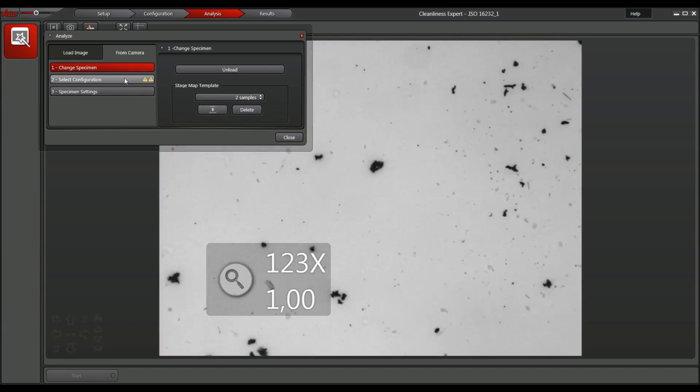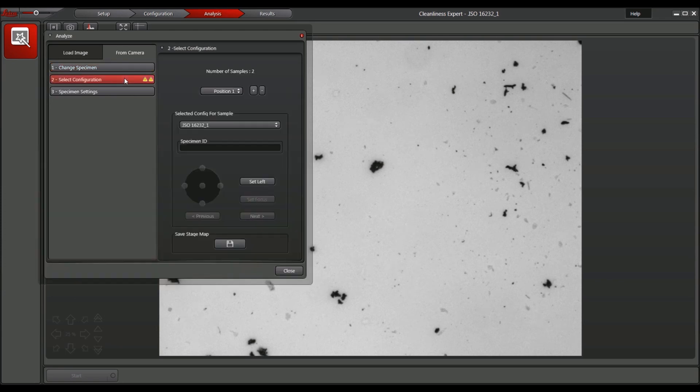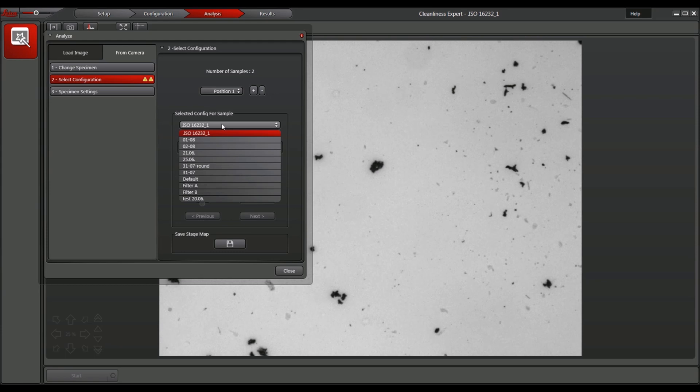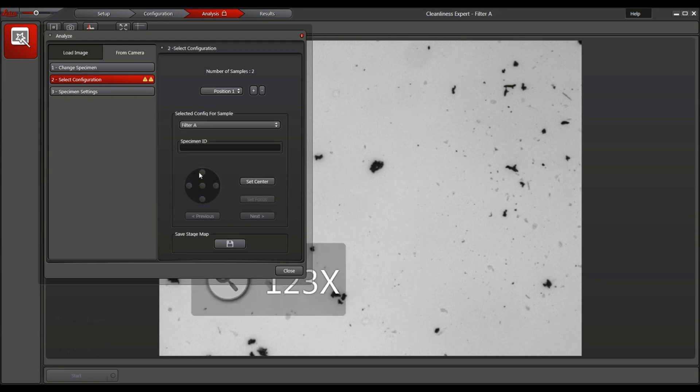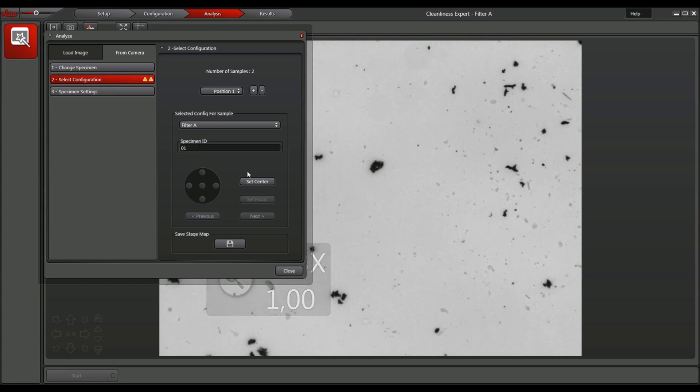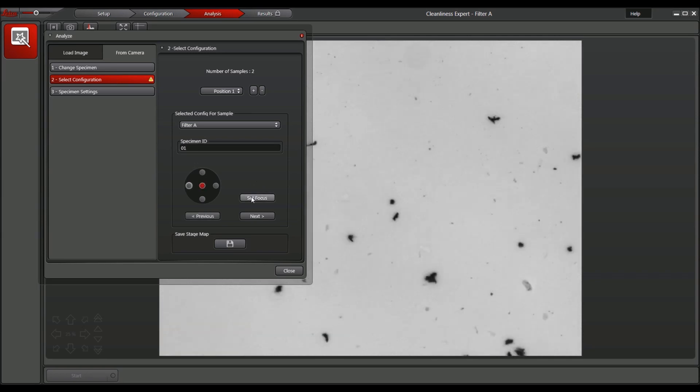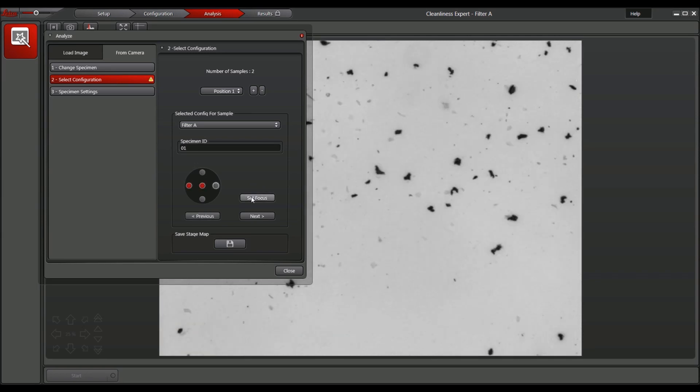In the next step, select a Filter Sample position and assign a previously defined sample configuration. Then, all required analysis information like microscope settings, threshold and classification are automatically loaded. The user just enters the Filter Sample name and confirms the chosen focus positions.